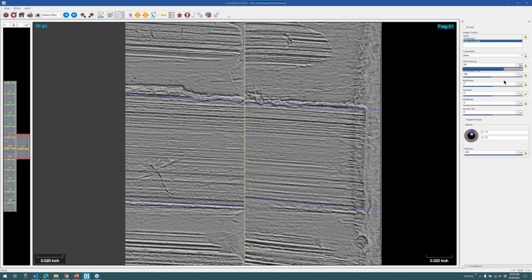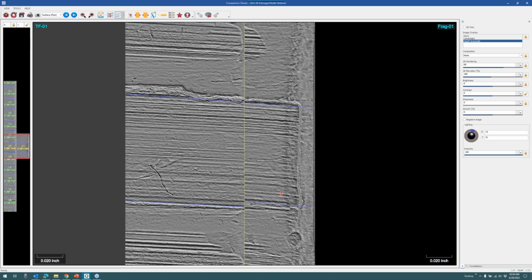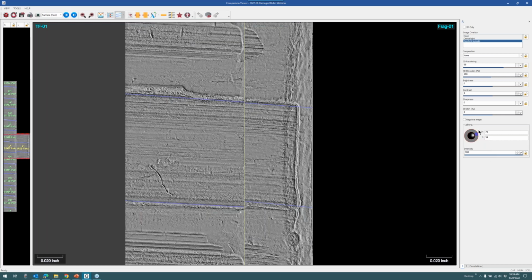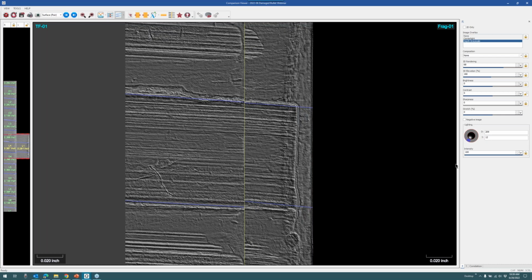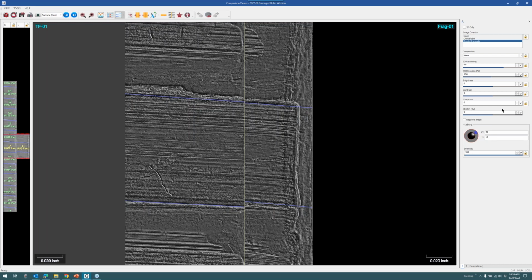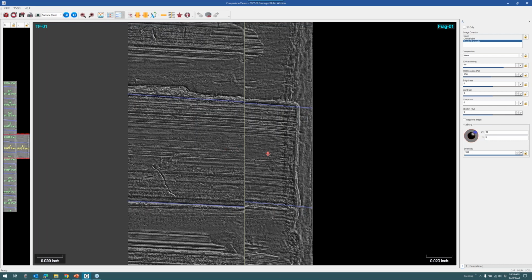I don't personally care about the number itself, 68 in this case. I'm not worried about the value. I'm just working with that tool. I'm giving it some, I'm taking some away until I find a balance where I like the actual amount that is applied to it and it's pleasing to my eye. Your choice might be different than my choice, but that's what's nice about this, is that everyone has a chance to set this to a way that they personally want to see it. And that includes the light angle here, where we have dynamic real-time light adjustments you can work with to get the overlap and agreement visible to your eyes in the best way possible that you want to see.